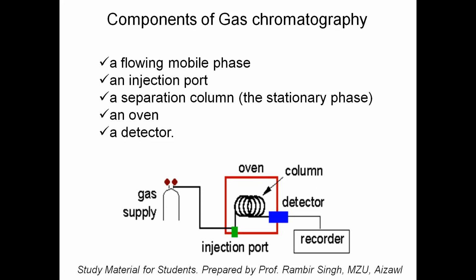Because we have to provide the optimum temperature to keep it in a vapor state, not a liquefied state.